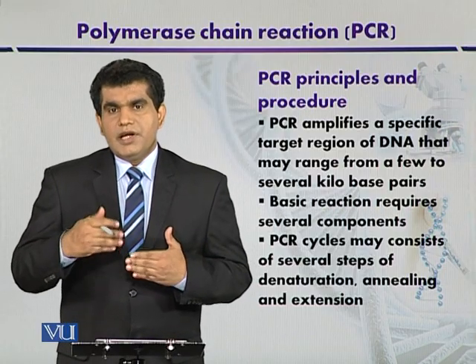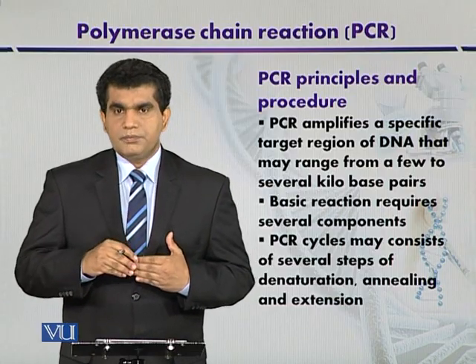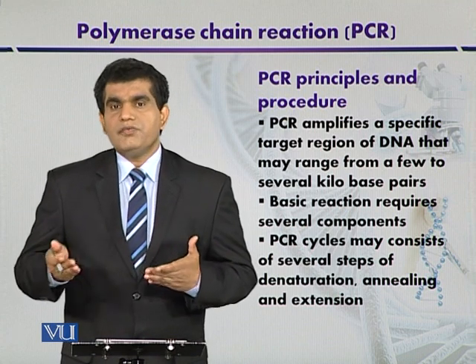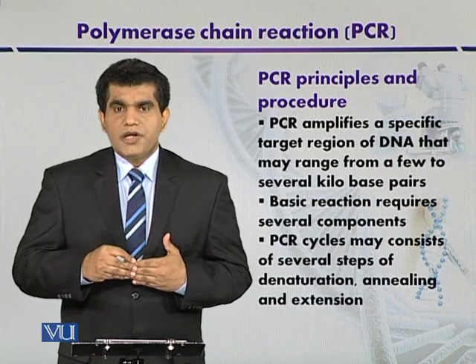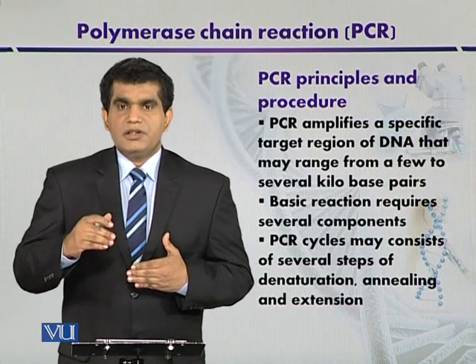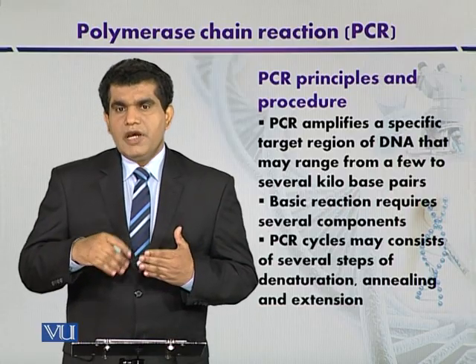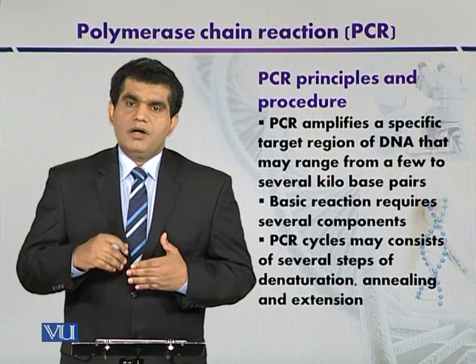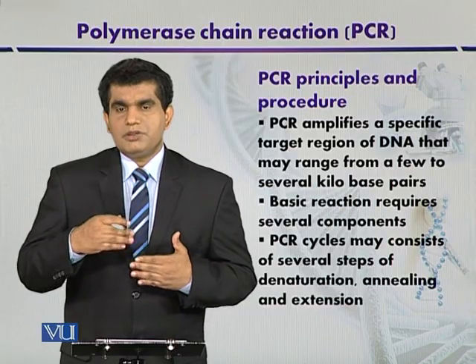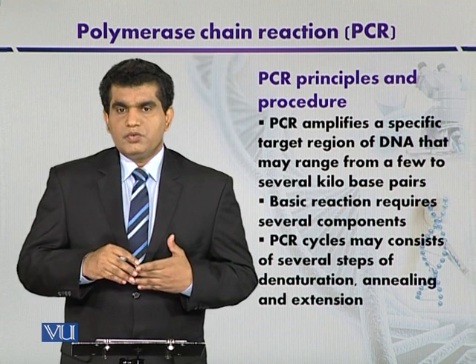And the next step is to expose the reaction mixture to the final elongation step, which may be, for example, 5 to 15 minutes. Why is this step required? It is required so that if some single-stranded DNA is present in the reaction mixture, it may also be extended. And if there are some bases that have not been incorporated, they are totally repaired. So this may be the advantage of the final extension that is carried out for 5 to 15 minutes.